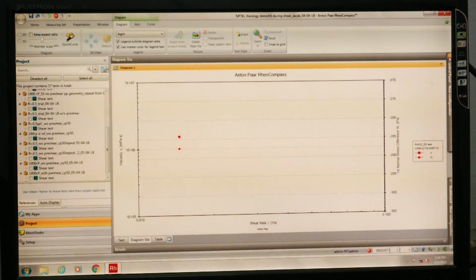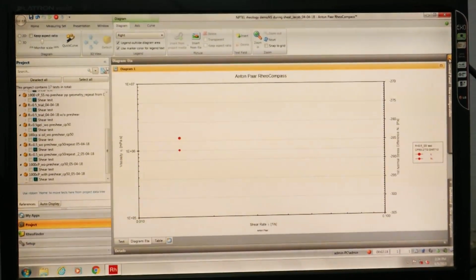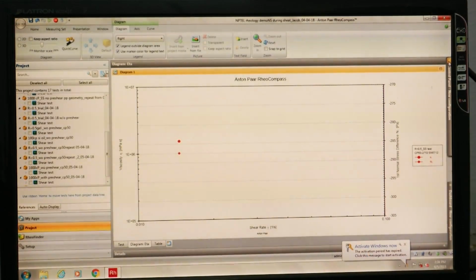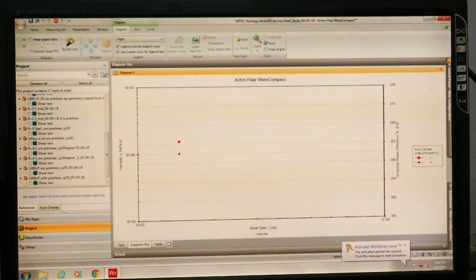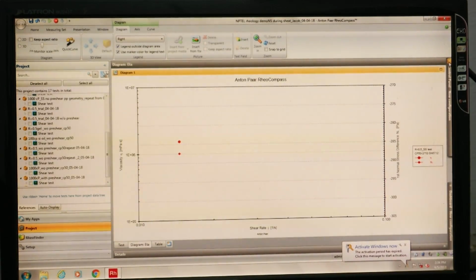That's why here you see that the first data points have appeared, but the next set of data points will take a significant amount of time. But when we go to higher strain rates, we expect the steady state to be reached faster. And so the measurement point duration for each and every measurement, how much time is required, is a very crucial decision that a rheologist has to make while doing the rheological characterization.